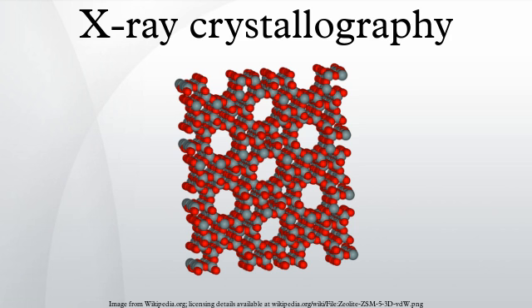In an X-ray diffraction measurement, a crystal is mounted on a goniometer and gradually rotated while being bombarded with X-rays, producing a diffraction pattern of regularly spaced spots known as reflections. The two-dimensional images taken at different rotations are converted into a three-dimensional model of the density of electrons within the crystal using the mathematical method of Fourier transforms, combined with chemical data known for the sample. Poor resolution or even errors may result if the crystals are too small, or not uniform enough in their internal makeup. X-ray crystallography is related to several other methods for determining atomic structures.